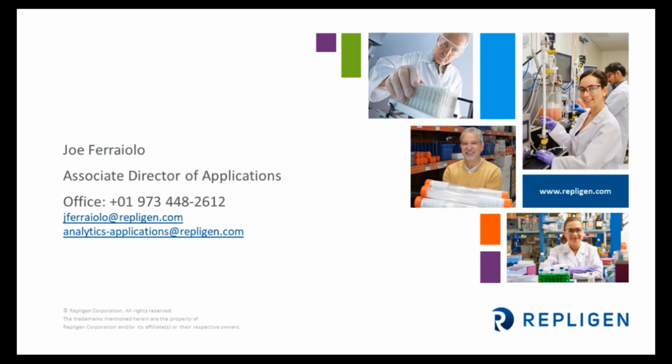So for empty versus full capsid quantitation, how pure do the samples need to be, and can this be used in cell culture harvest? The data that we've generated, or we're talking about, they should be pretty clean to use. We're not saying that it can't be done. We certainly are working on applications with regards to dirty samples. I would say stay tuned on that. But for now, what we feel 100% confident in is that it should be pure material.